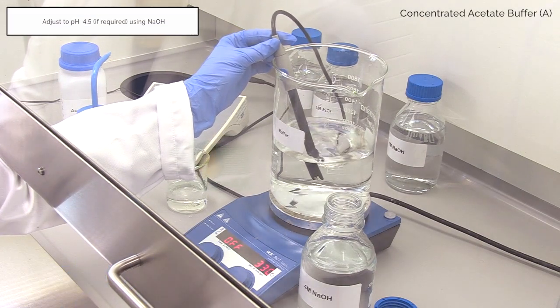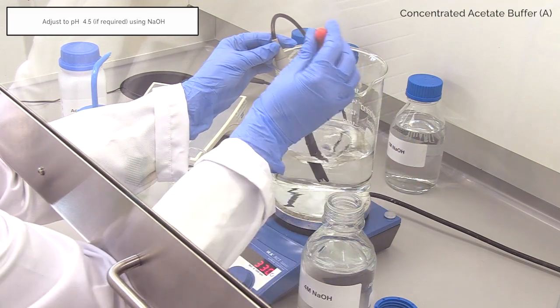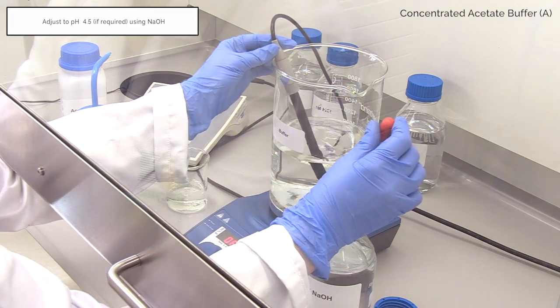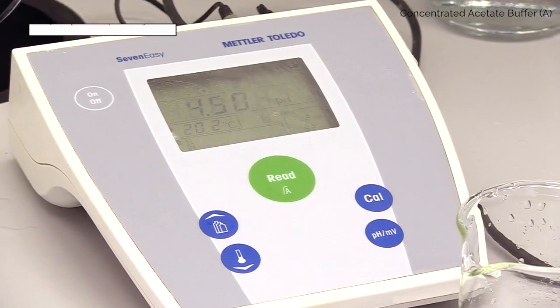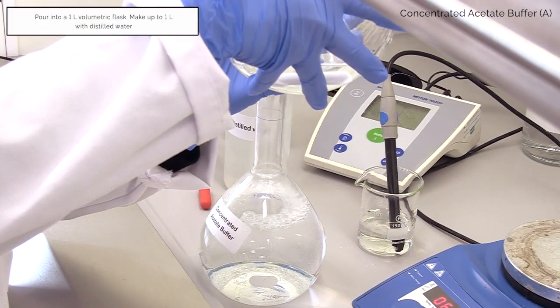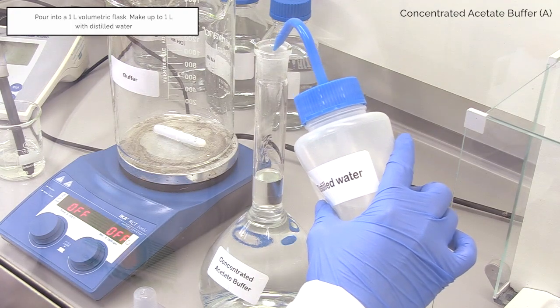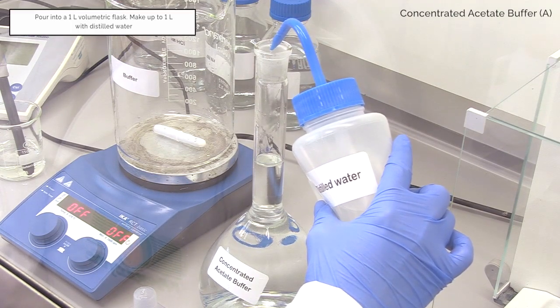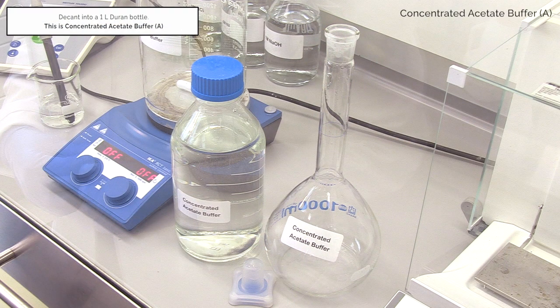Adjust the pH to 4.5 using 4 molar NaOH. Pour into a 1 litre volumetric flask and make up to 1 litre using distilled water. Decant into a 1 litre Duran bottle. This is concentrated acetate buffer A.